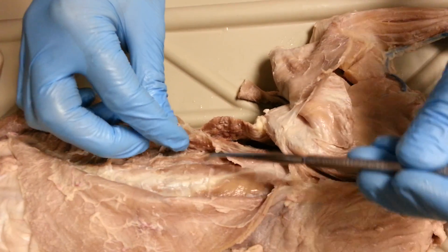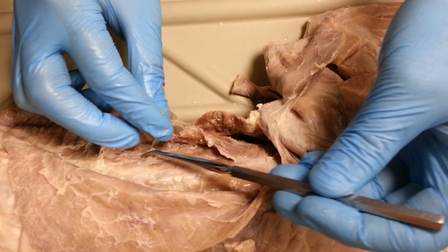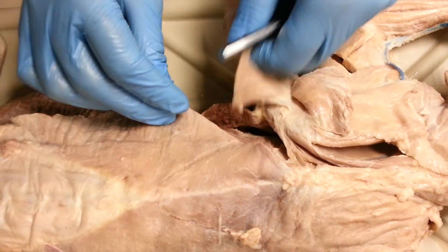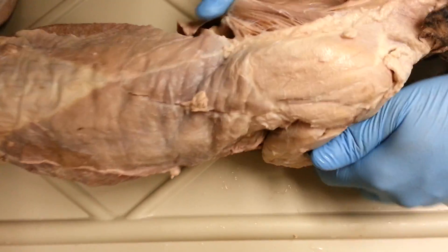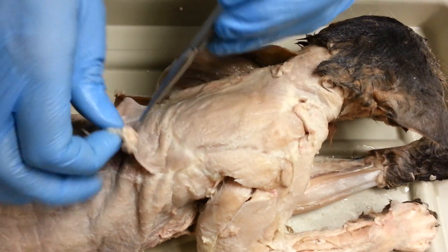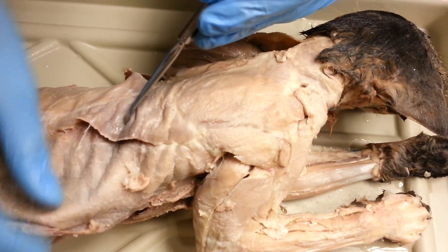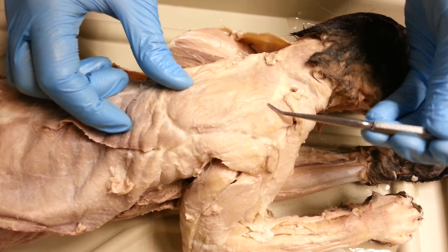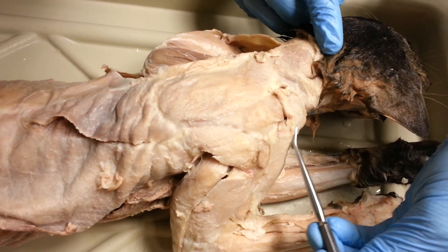Underneath the serratus dorsalis, we have our iliocostalis right here. So this is our serratus dorsalis. Let's put this down and take a look at some of the dorsal lower and upper back muscles. Here we have the spinotrapezius, this one right here. This one is, of course, the latissimus dorsi. Spinotrapezius, this one — the round one right here — acromiotrapezius. And here, this one right here, clavotrapezius.